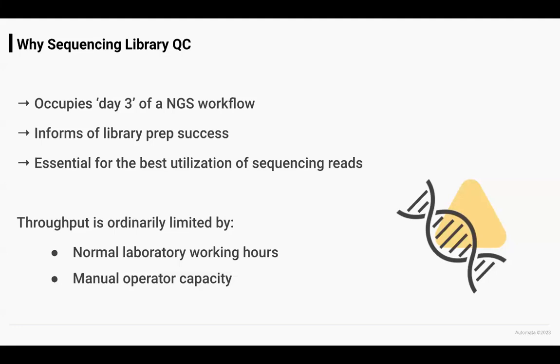But personally, my experience is that when you're working on an NGS assay, there's always that extra day where pretty much the only job is to quantify, pool, and load the sequencer. But it's super important, but no one really wants to do it. It's very repetitive. You flip a coin, you make a rota, because it's important but boring. So I think, because it's so routine, it's low-hanging fruit for automation. A lot of it will be automated already, but it still has that machine tending where you have to move things between instruments.